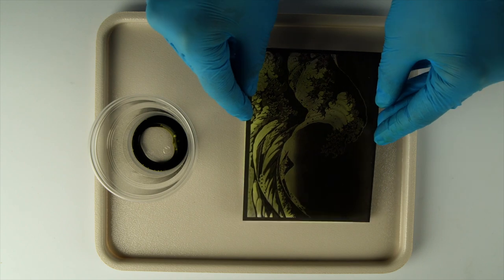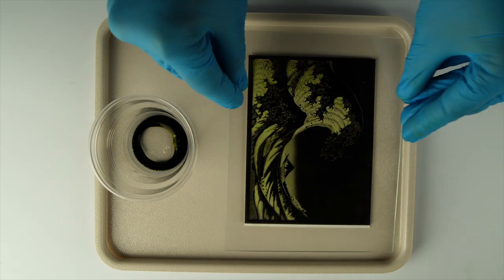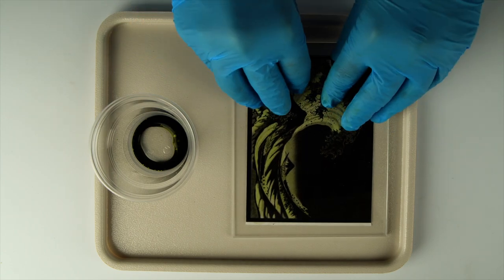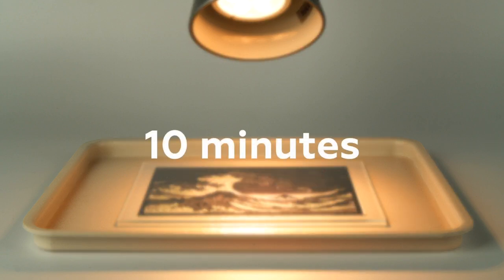Let's start printing our image. Place the negative image on top of the paper. Cover both sheets with the plexiglass. Put your materials under a strong lamp. Leave about 4 inches distance between the lamp and your materials. Wait for 10 minutes. As an alternative, you can put your setup under direct sunlight for 3 minutes.